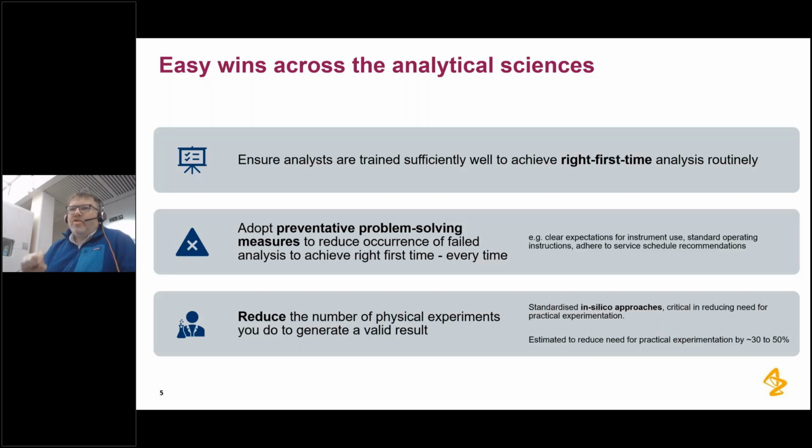And are we setting clear expectations on our scientists and our users of instruments about how they look after the instruments, how they're trained to use them, so that they understand the instruments well enough that they can do basic troubleshooting, but not necessarily be super engineers able to fix everything?